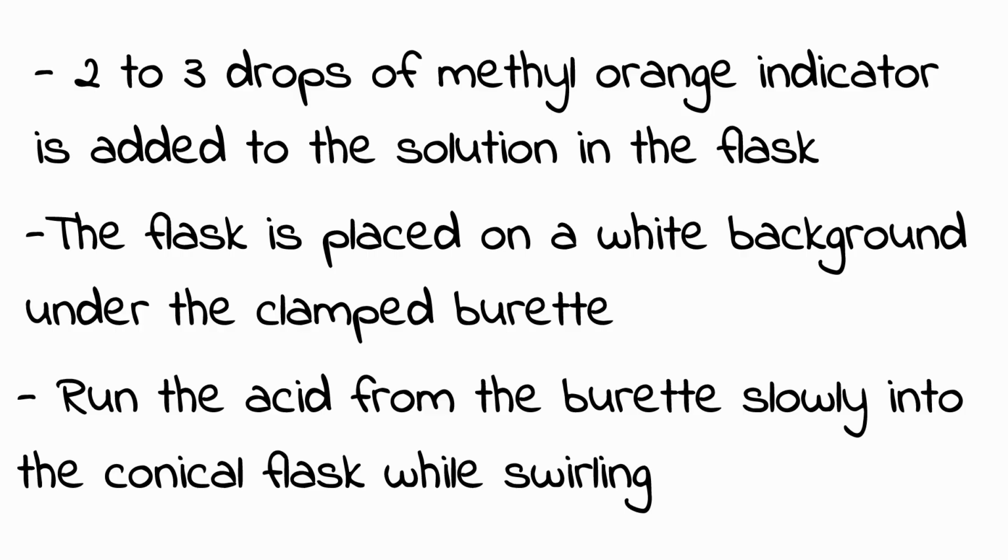Why the choice of methyl orange? Why are we using methyl orange indicator? We know that sodium carbonate is a weak base and hydrochloric acid is a strong acid. In the titration of a weak base and a strong acid, the indicator that is suitable for such a titration is methyl orange.